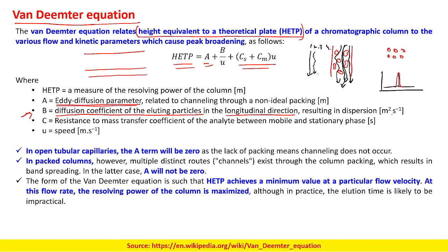So this is a longitudinal direction. Okay, now any column, I don't know whether you have seen a column or not, it will be having a broad area over here. However, while getting out there will be a narrow opening.